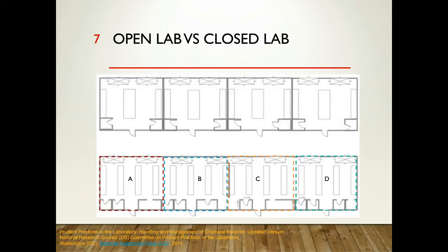although it's beautiful and a lot of architects are pushing towards it just because it's nice open concept. A lot of people like that in their homes as well. It doesn't always lend itself to the best and safest environment for lab research.